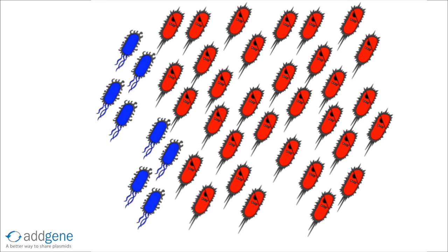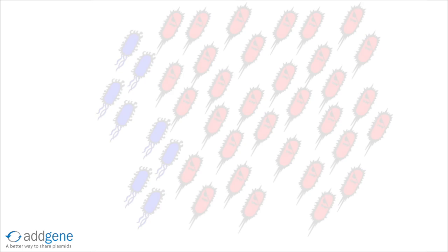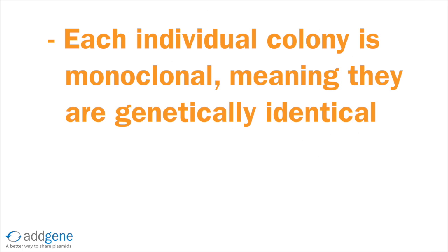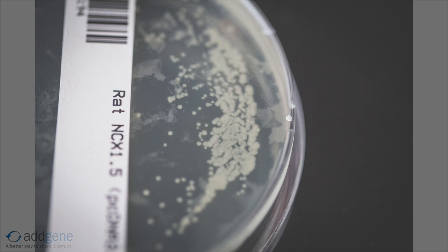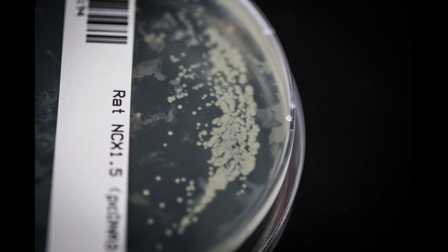We solve this problem by streaking for single colonies. In this case, each individual colony is monoclonal and the vast majority of colonies will be wild type. Starting liquid cultures from these colonies will generally lead to expected plasmid yields and more consistent results in later experiments.